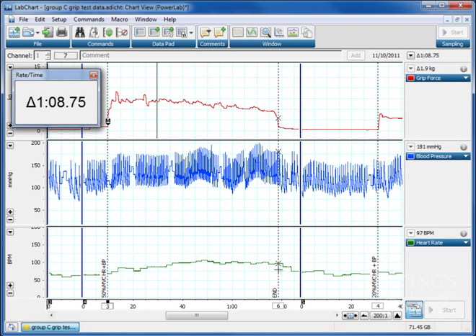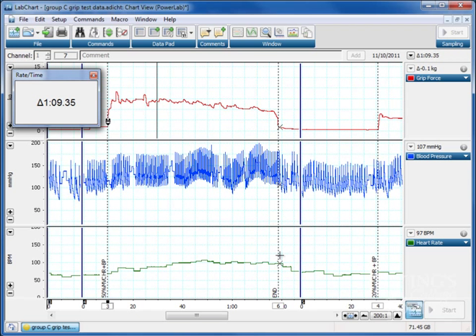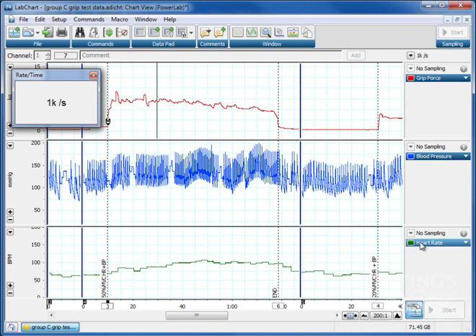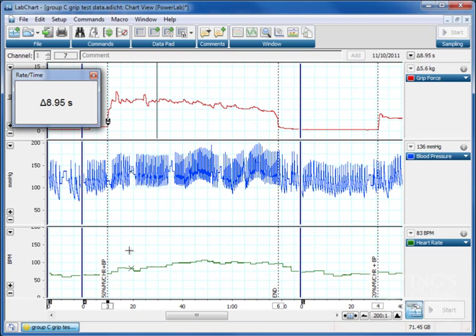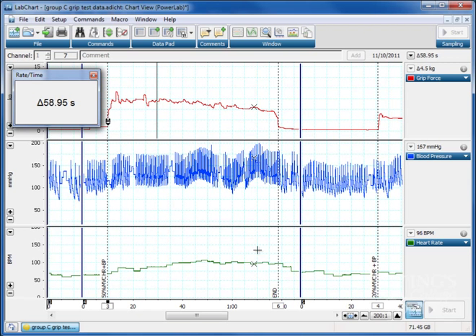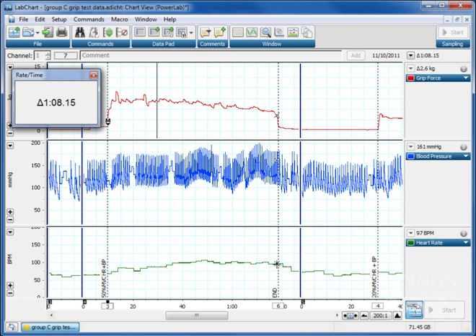So we want to look at these data and find out the change in heart rate. We could just hold our mouse over each of these positions and look at the number and copy them down onto a piece of paper. It's one way of doing it, but it's not a very accurate way because what you're doing is indiscriminately choosing time points based on instantaneous readings of heart rate. You can see here the heart rate kind of fluctuates, goes up, fluctuates a bit and comes down.